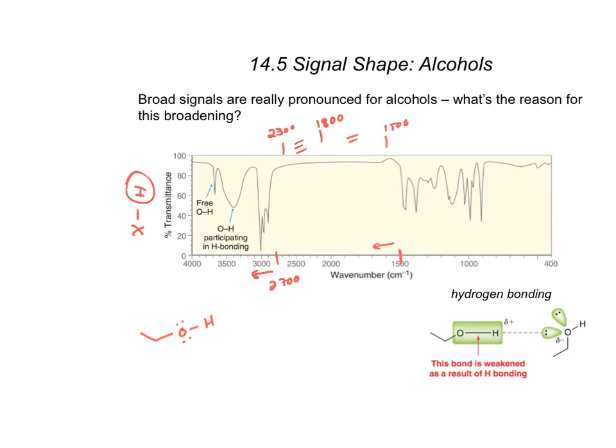And so we'll say, okay, we expect to find this bond at this very high wave number over here, to the left of 2700, and specifically for this oxygen-hydrogen, we expect to find this at about 3600 inverse centimeters, okay? So that's one thing. That's where we expect to find this bond depending on the energy of it and its vibration. We do get a nice charge separation, right? Nice polar bond, so we have this nice dipole moment.